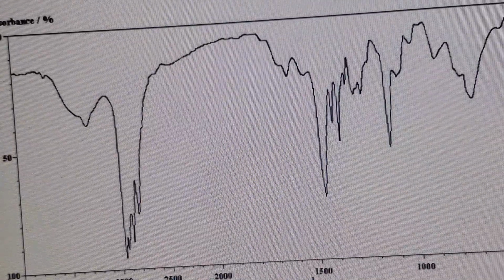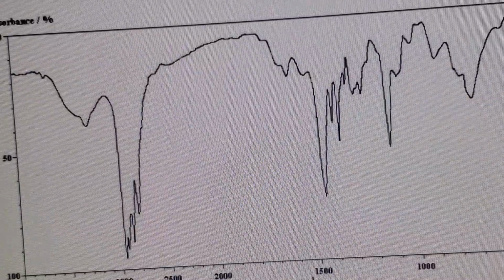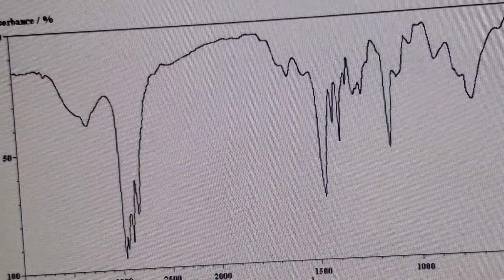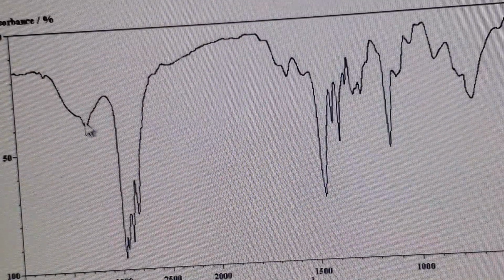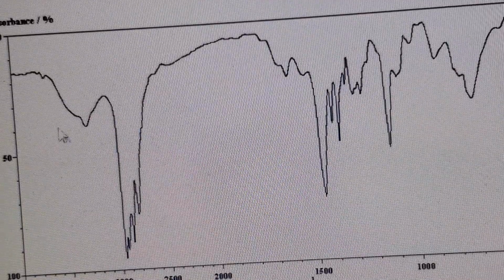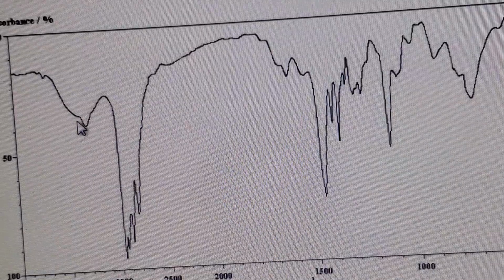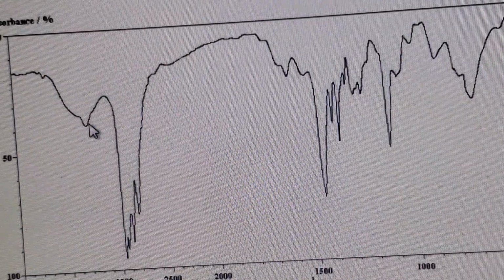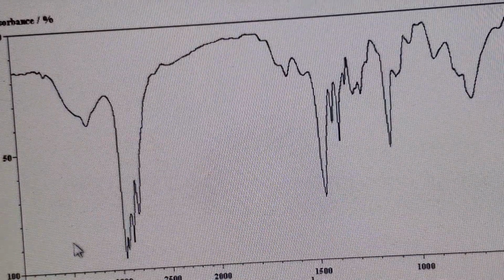So, as we go through this, you're not just memorizing numbers, you are learning the features, the practical examples with a lot of variations, right? So again, here you see a little weird looking mountain kind of thing. I mean, not mountain, it's an upside down mountain, so it's a little valley. Absorption. This is not quite OH, because OH should be somewhat intense.